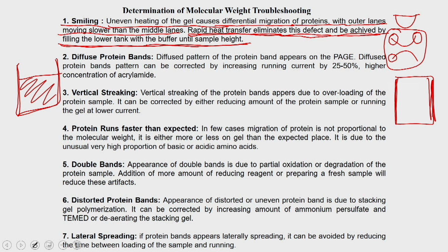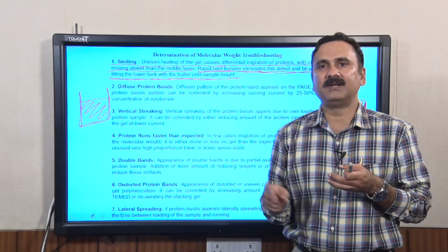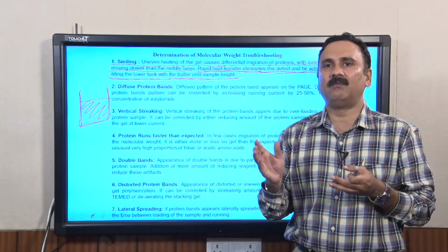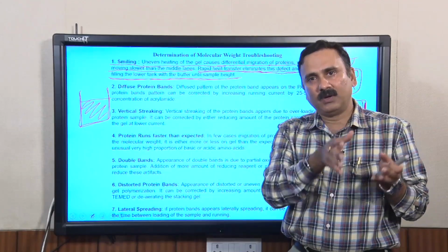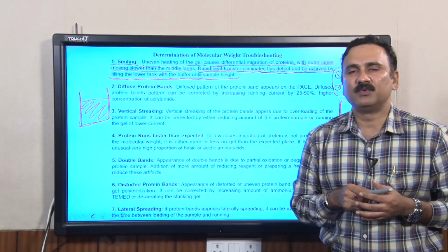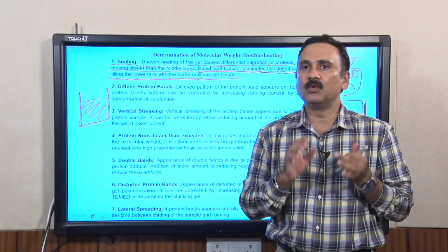And you can actually recycle this buffer as well. If you see that the protein is heating, or your apparatus is getting very hot, then you can exchange the buffer, or you can put it into ice bags, so that the buffer which you are filling outside is very cool.